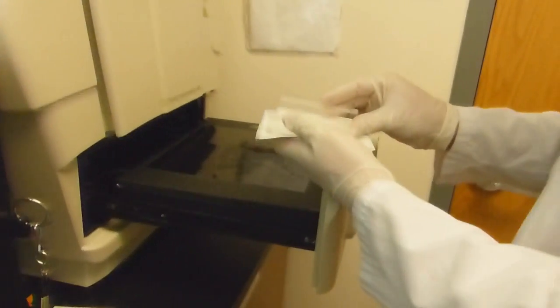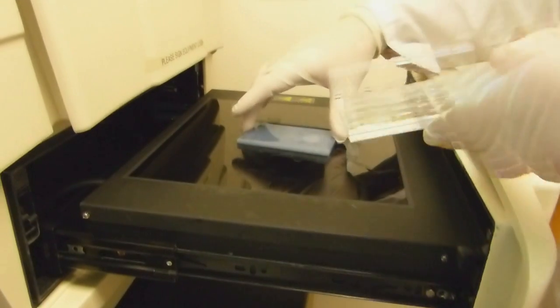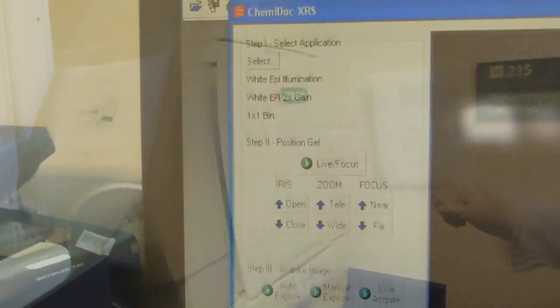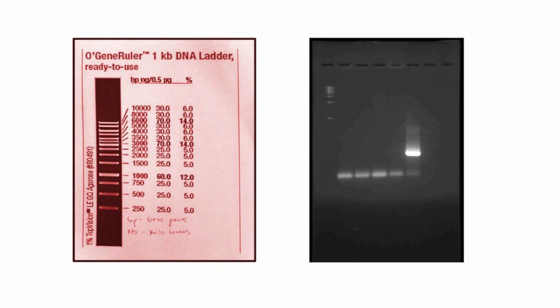Imaging the gel on a UV transilluminator will cause the ethidium bromide to fluoresce. Wherever there are concentrations of nucleic acid, a band will appear. We will be looking for bands that show us 16S rRNA has been amplified. If we see it, our samples likely have mycoplasma contamination. The gene ruler allows us to measure what we're looking at. Comparing it with the gel, we see there's only one band at 270 base pairs, and that is our positive control. Primer dimer, it's a happy day. We don't have contamination.